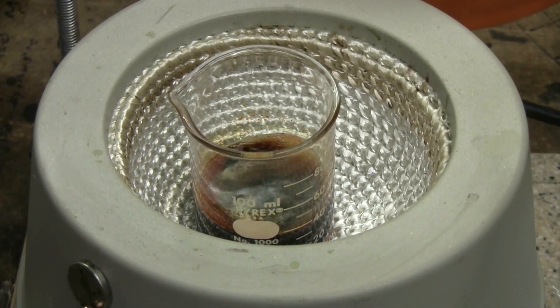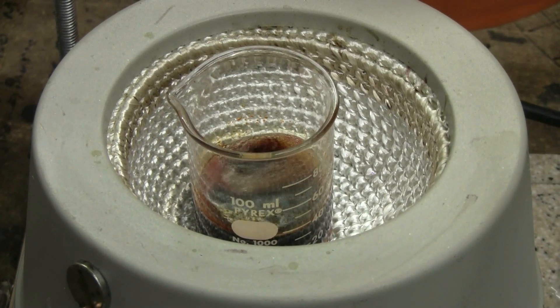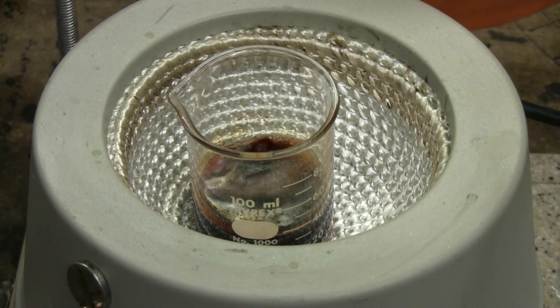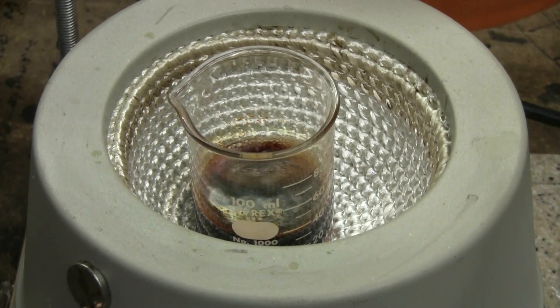After distilling off most of the ethanol from my extract, I was left with 40 milliliters in total that I put into a 100 milliliter beaker. I'm now going to boil it down to about 10 milliliters or so, and that will be my product.